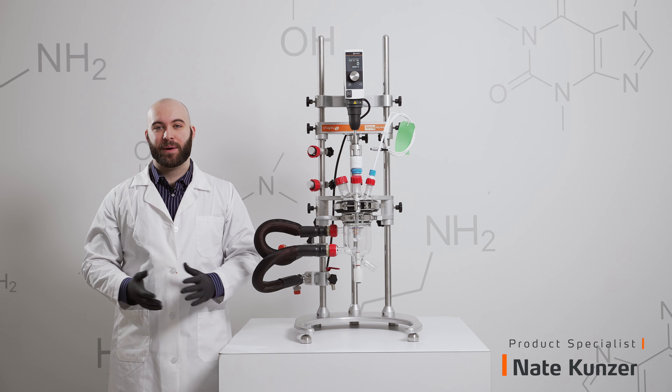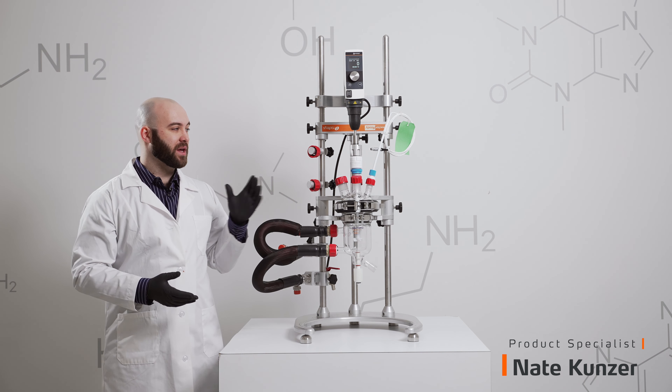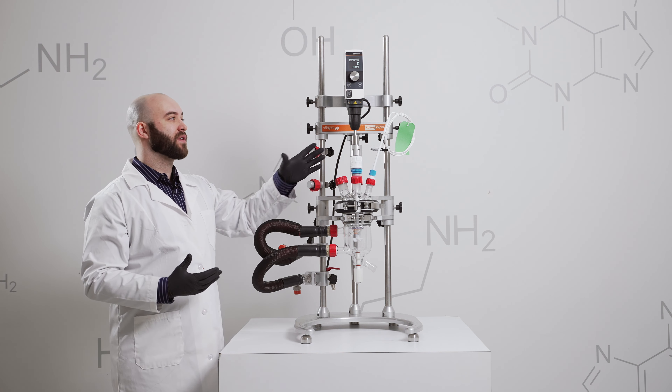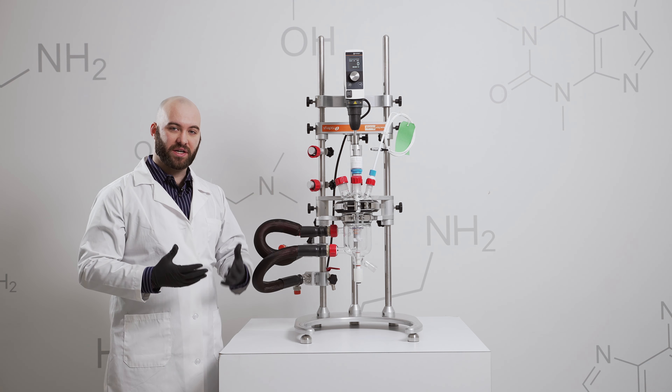Hello, I am Nate from Heidolph, and today I'm going to be showing you the Reactor Ready's drop-in coupling and how it is self-aligning, so you don't have to perfectly align your overhead stirrer every time you swap reactor vessels.